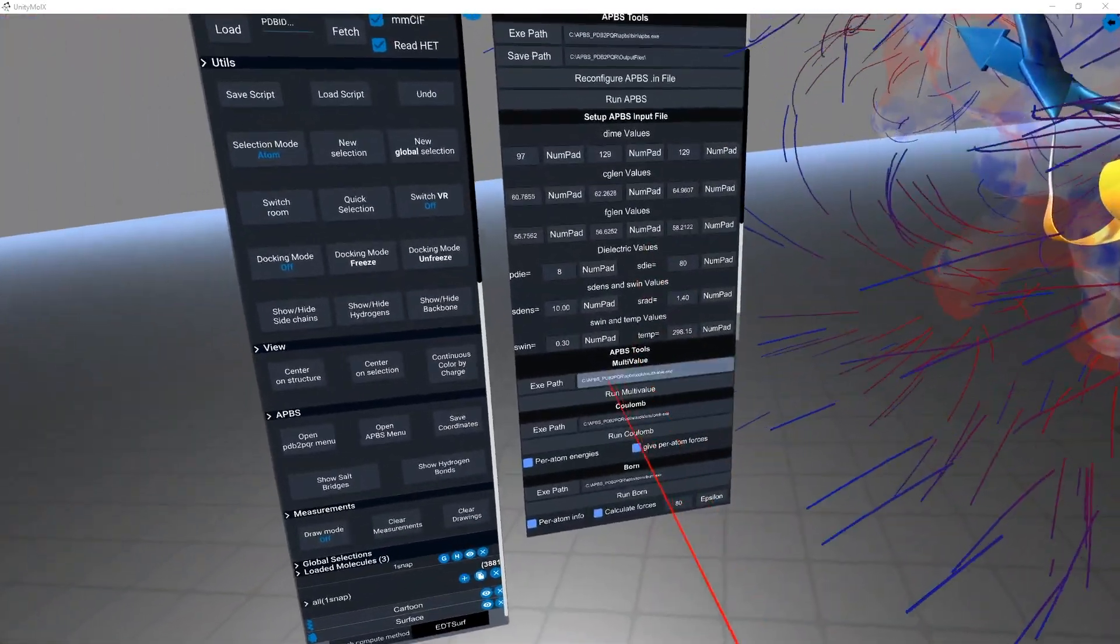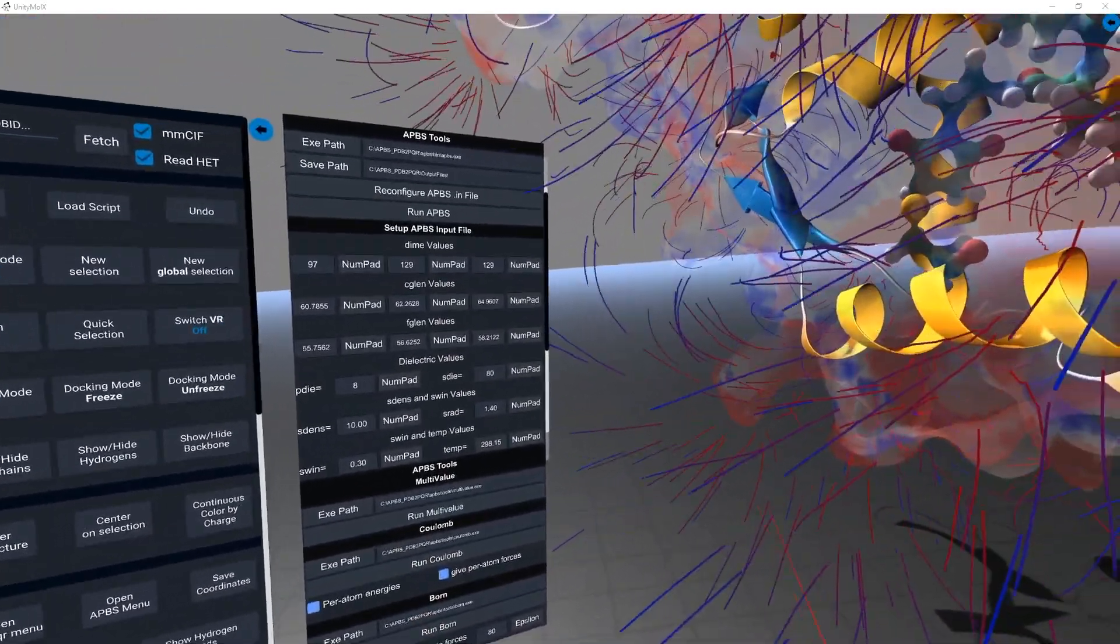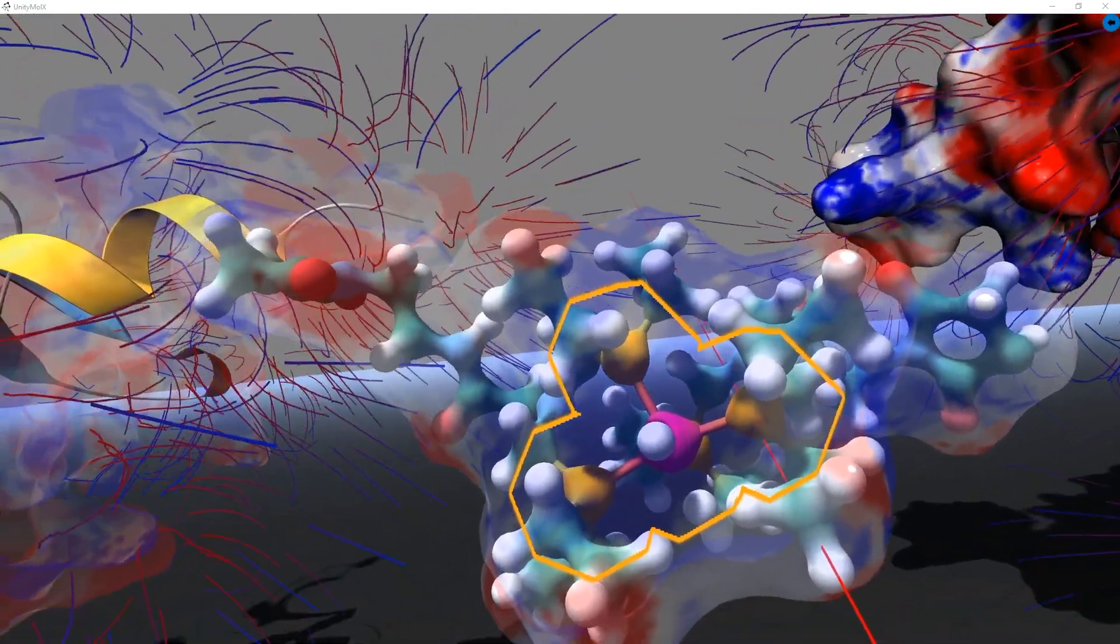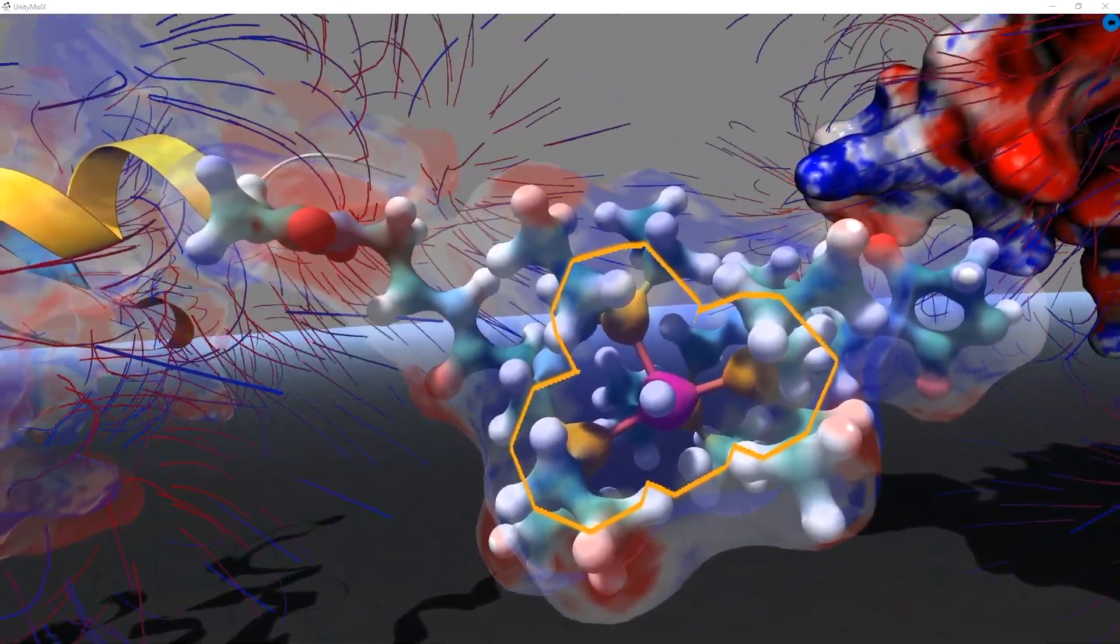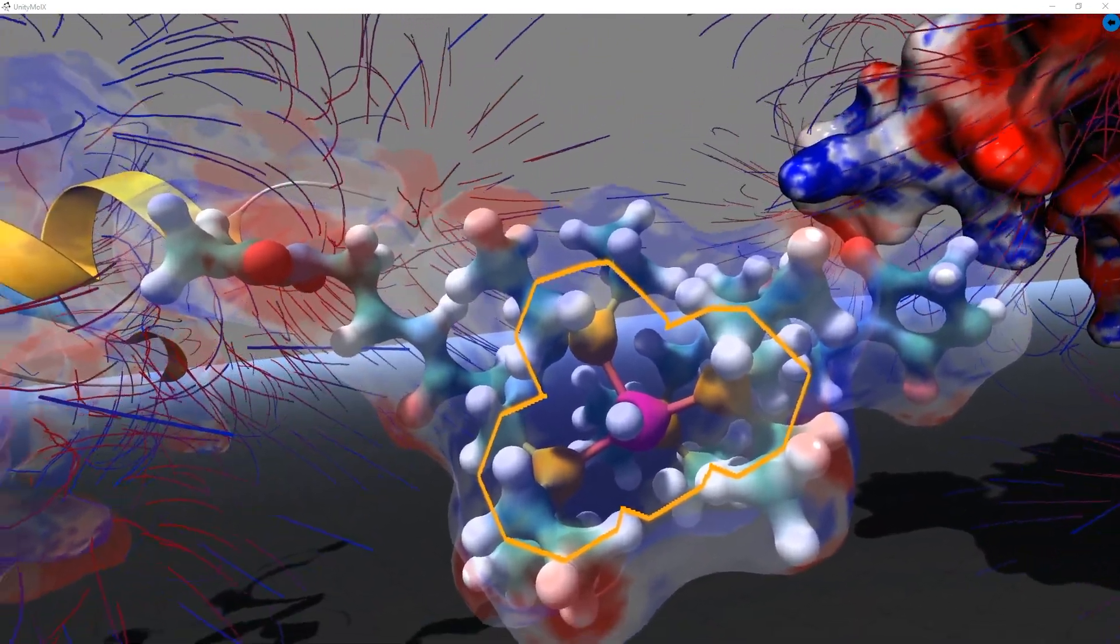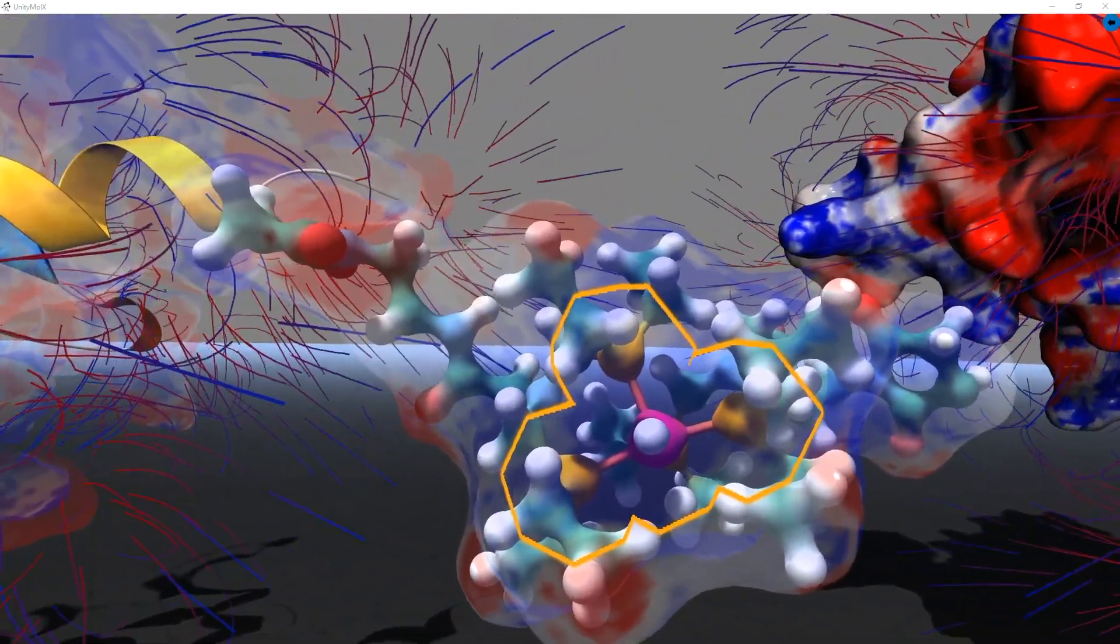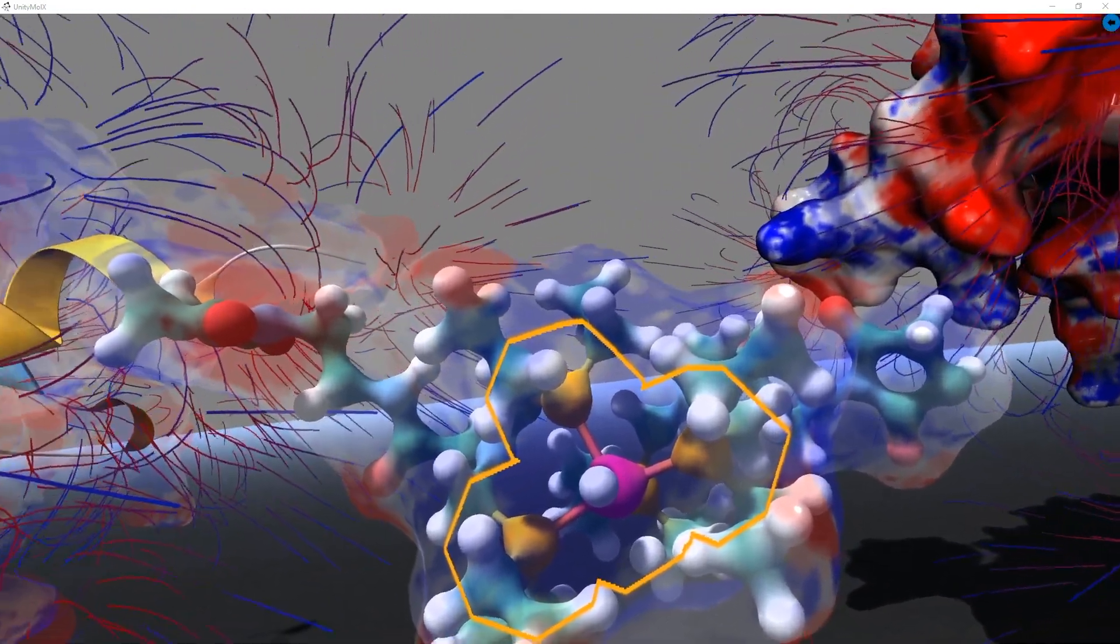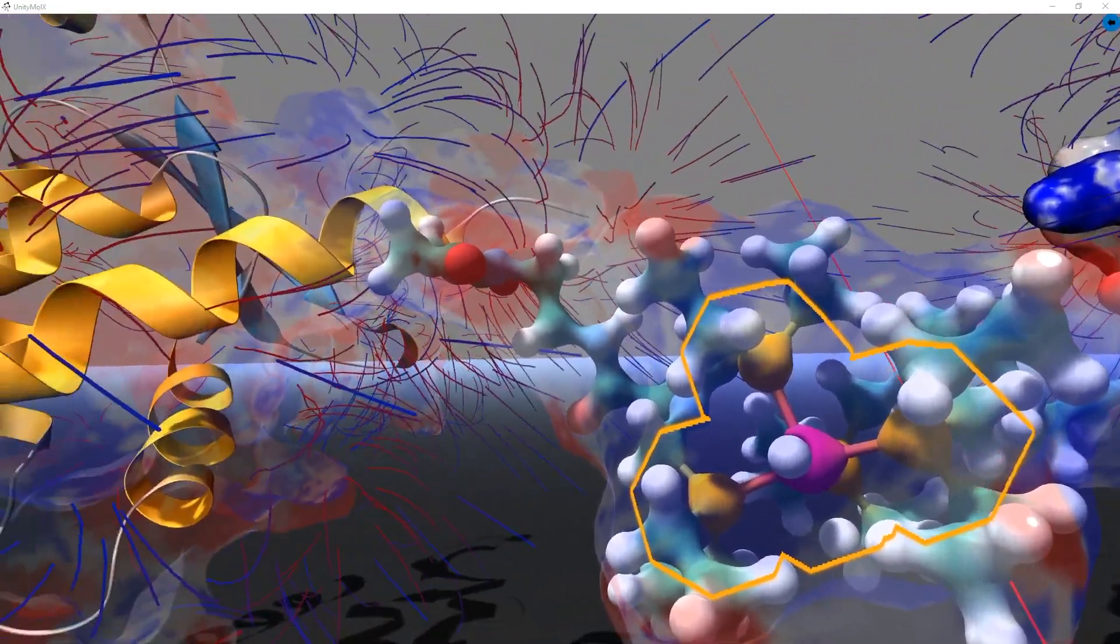Now that we have the atoms selected that we are going to investigate, we simply just have to click the multi-value button. If the APBS tools are in a different directory, we can use the buttons on the menu to select the location of the multi-value executable.